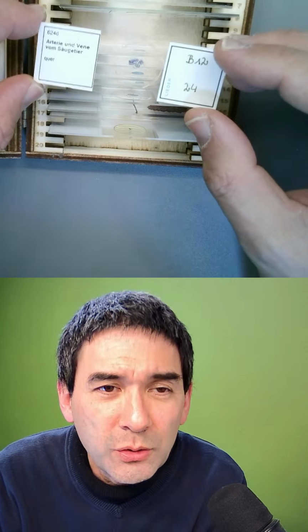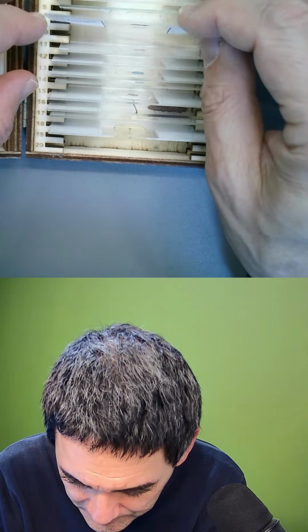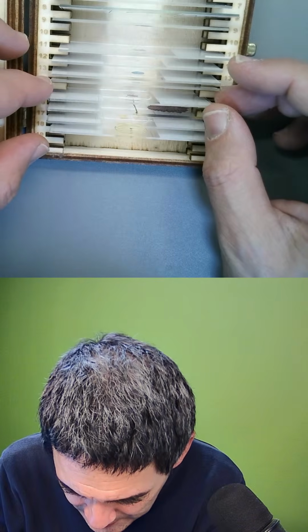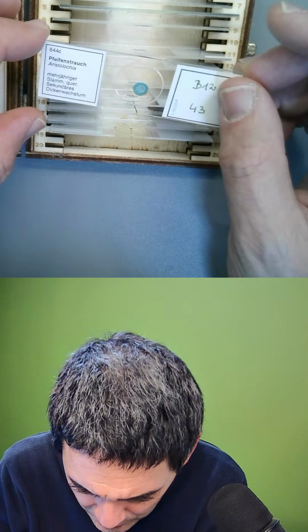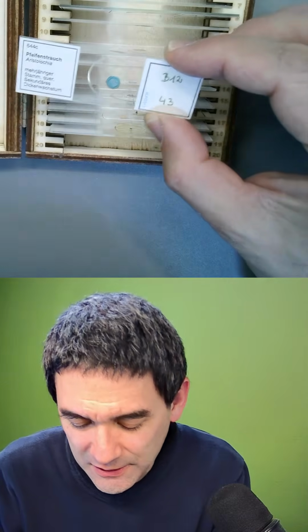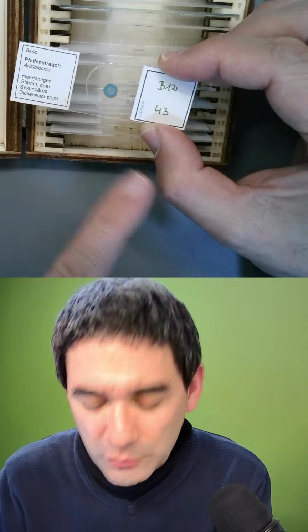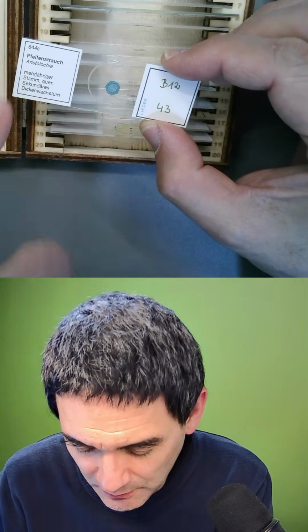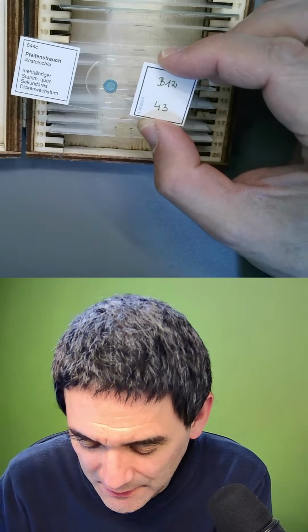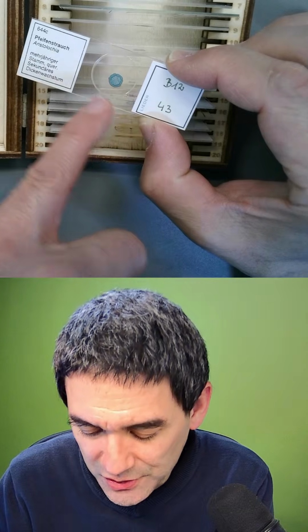Okay, that's a more histological one that I show my students, artery and vein. So I'm going to jump ahead now. Where is this? Here, this is Aristolochia. That's it. This slide here has a little history. This is basically the cross-section of a stem of a plant, Aristolochia. It's a fairly large one, about 5, 6, 7 millimeters across.